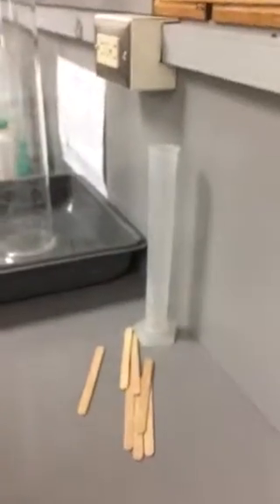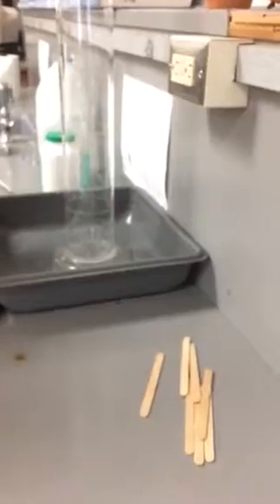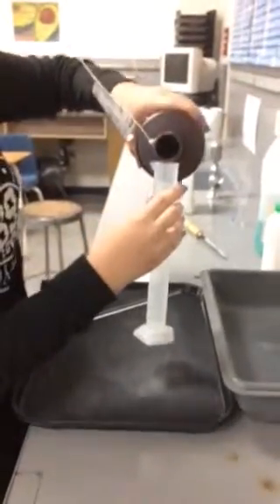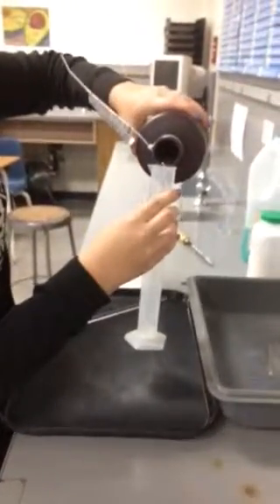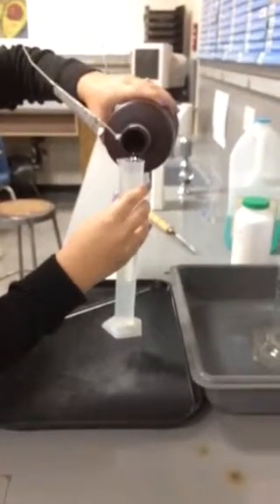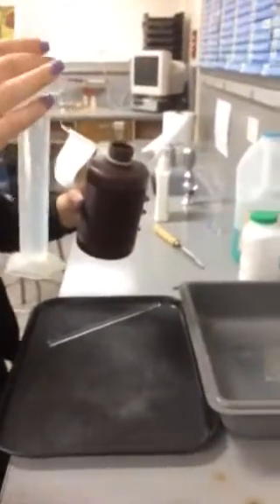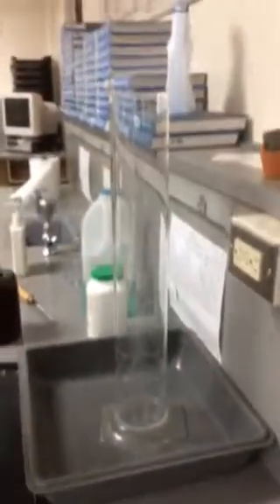So Shoshana, go ahead and fill that tube up, the graduated cylinder there. That's a 100 mil graduated cylinder. Fill it up about 2/3 of the way up. Okay, that's it, and away we go. Now you don't want to get that on your hands. That's pretty rough stuff. Okay, she's got it. Let's go ahead and put that in the big elephant tube.